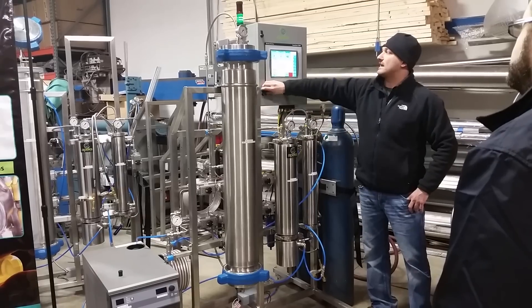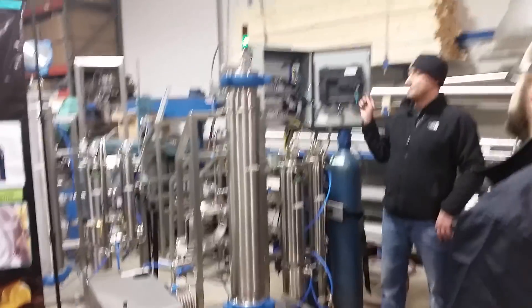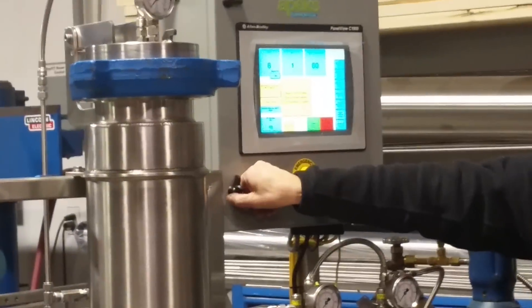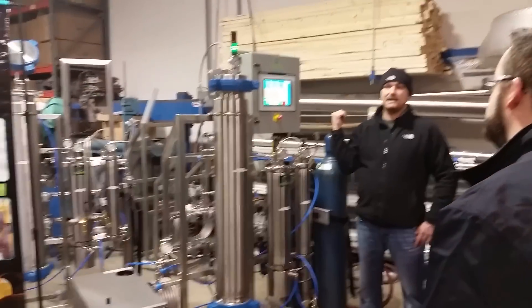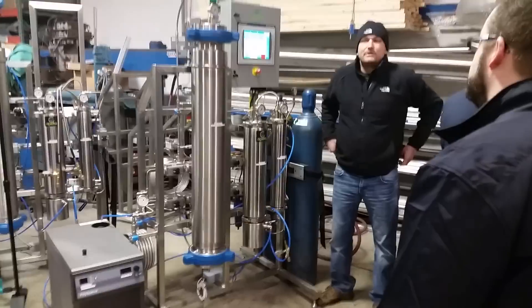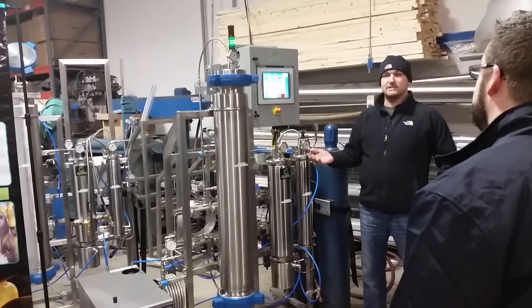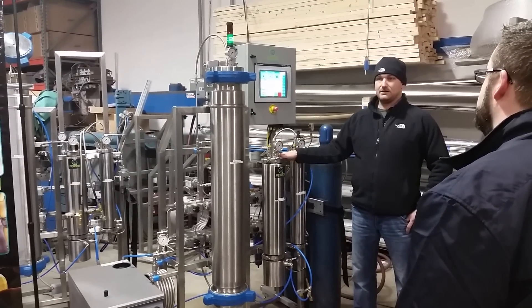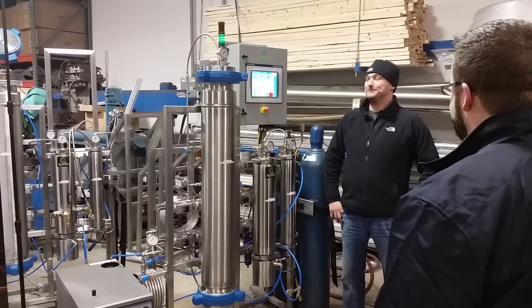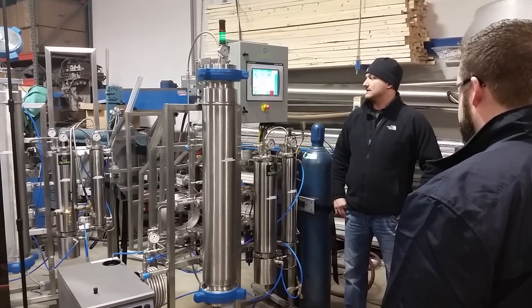Something new we've got — we now have internet capabilities. If something goes wrong, here are the new internet modules that Jeremy is responsible for. During the run, it'll let you know when it's done. If something happens in the middle of it — your electricity dies, which is a big problem — these systems require those large air compressors up there. During the summertime when everyone's running their ACs, you might get a blip in the electricity and your system dies. If you've got a 24-hour run time, you want to know if your system just died two hours in. So it'll send you a text message, or if you get an orifice clog. When it's done, you get a text message and then you come back and continue on.